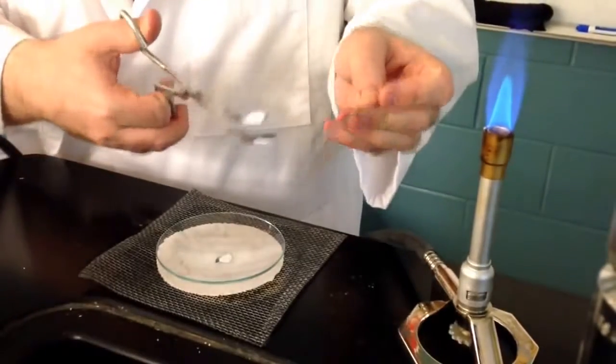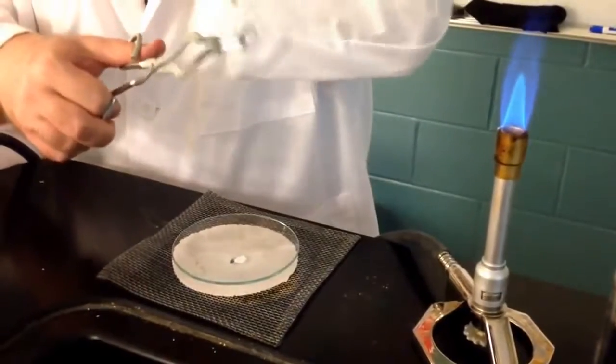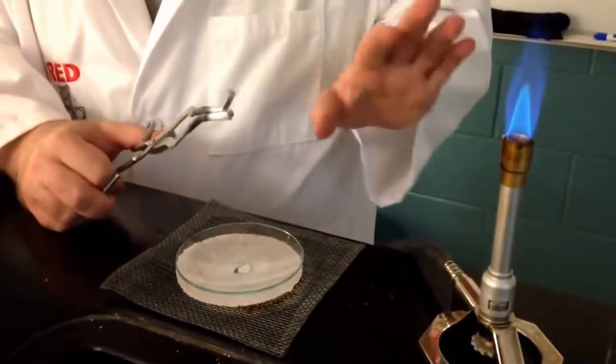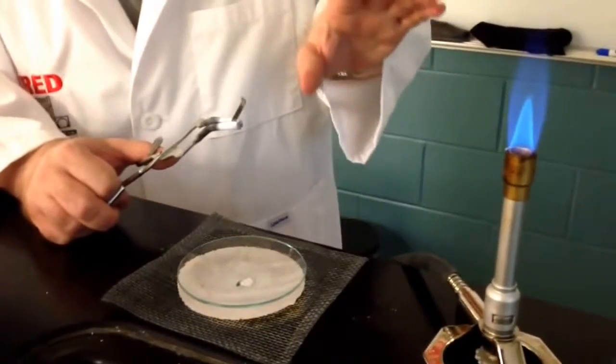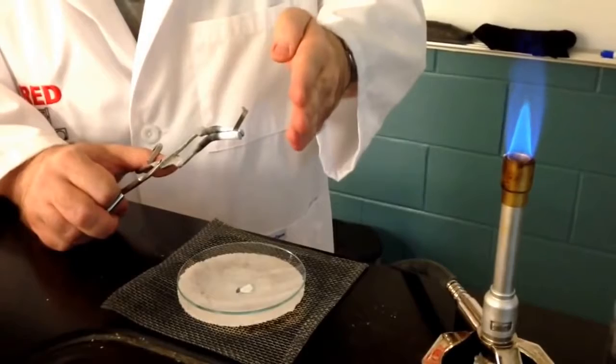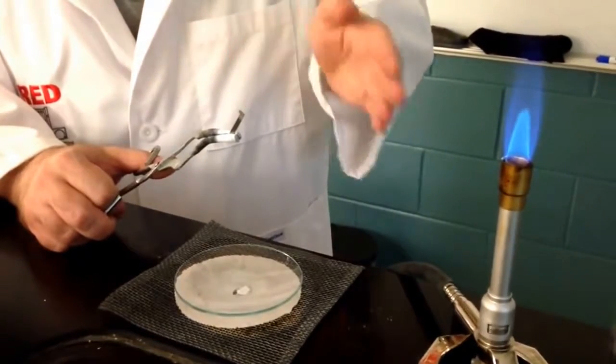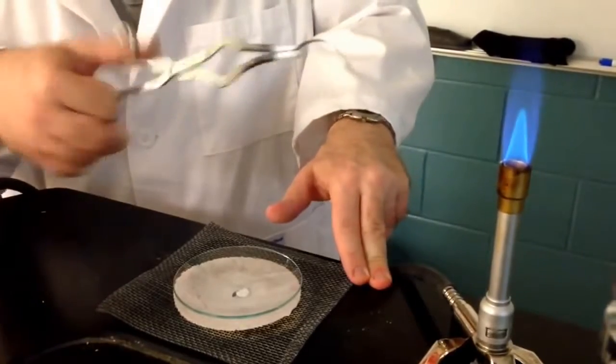We're going to use crucible tongs and hold the magnesium in the flame without directly looking. You never want to look directly at the burning magnesium. It's going to emit a very bright white light, so you want to make sure you look away so that you don't damage your eyes or vision. Make sure you look away from the flame as the magnesium burns.